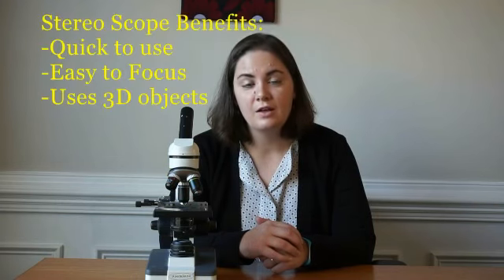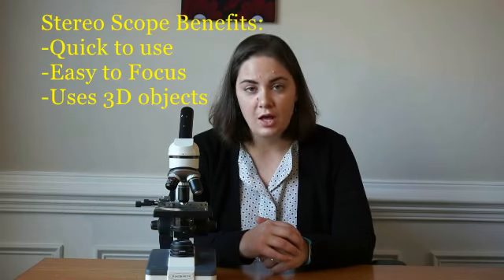The stereo microscope is a great choice for students just entering middle school, or if you have younger elementary school age children at home that may also be using it. It's quick to use and will generate scientific interest with your children extremely quickly. They can place any 3-dimensional object under the scope and be able to focus it in just seconds.